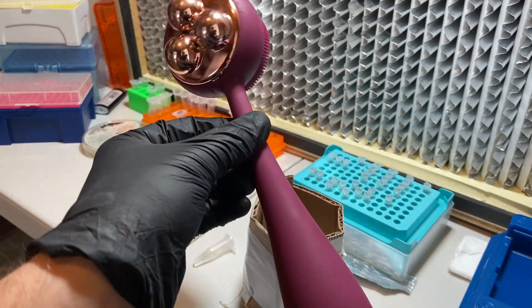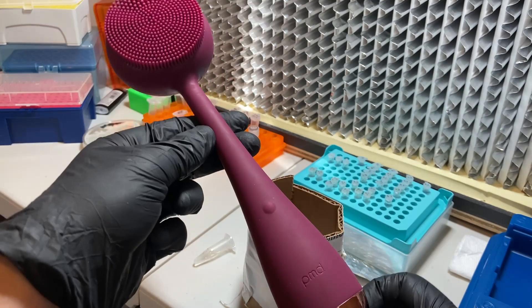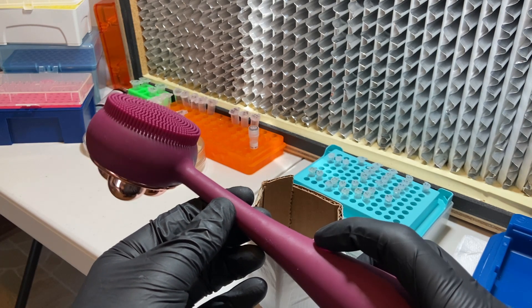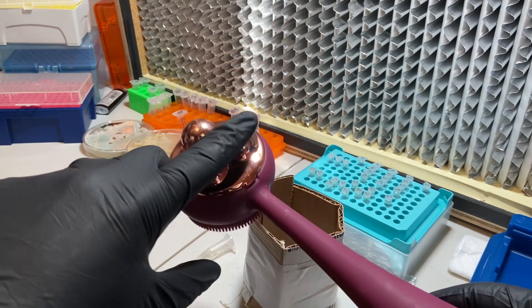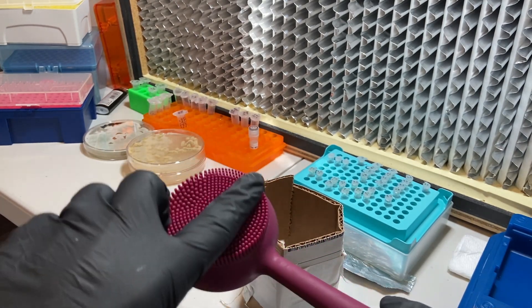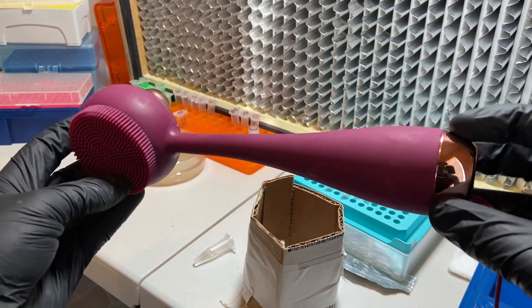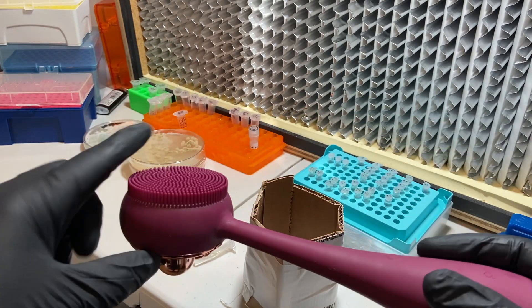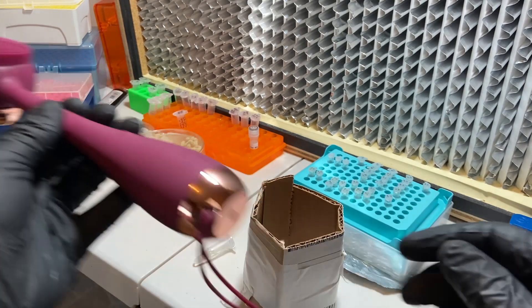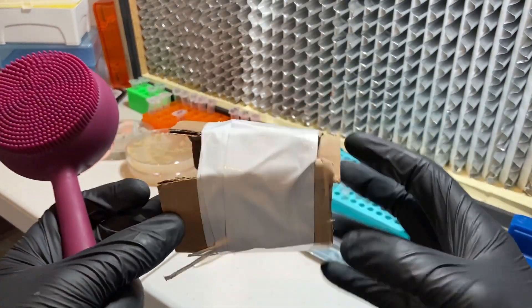I'd like to demonstrate the DIY vortex mixer. I have here a personal massager with variable speed — three speeds. It has this bulging area on the back and a flat area. I'm using this particular massager, but you could use any other that fits the similar concept, preferably something with a flat edge, though that's not required.